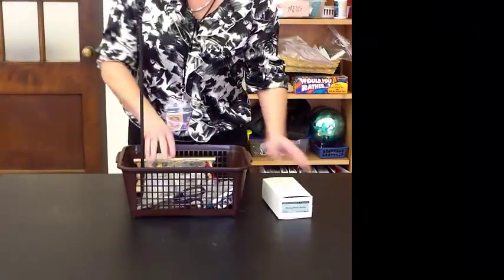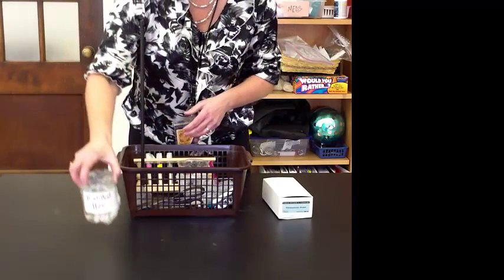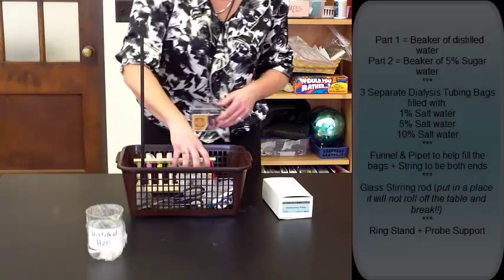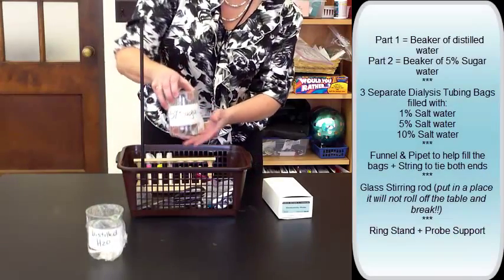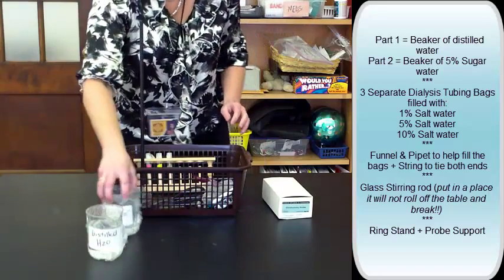For the Diffusion Lab, first you need to unpack your basket, and you're going to have 300 ml of distilled water, already pre-measured, and 300 ml of 5% sugar. We're going to use that for part two, so you can set that aside.